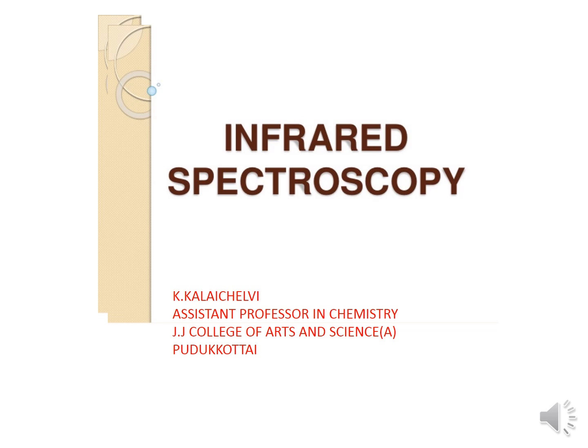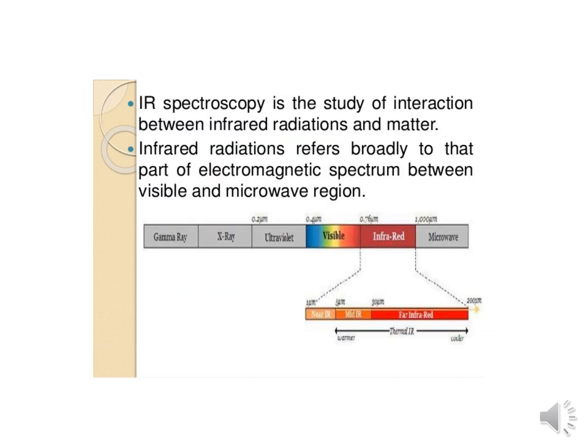Now we have discussed infrared spectroscopy. What is meant by spectroscopy? Spectroscopy is the study of the absorption and emission of light and other radiation by matter. Infrared spectroscopy is also the study of absorption and emission of light. So now we have briefly discussed infrared spectroscopy.